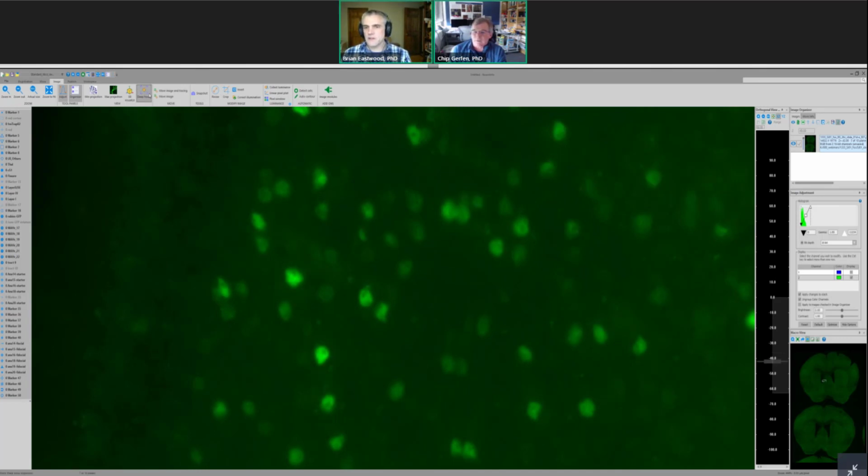I like this example because when you're looking through the focal stacks, there's no single plane where I would say things are relatively well in focus, but deep focus enables us to get around that. So you can see in this plane, this neuron's in focus, and these are kind of out of focus. In this plane, this is more in focus, and this now in that plane. So when we apply the deep focus, they're all pretty much in focus. Anyway, regardless of using the cell strength algorithm or the neural networks, it helps to have the cells that you're looking at in focus. Okay, so let's apply this.